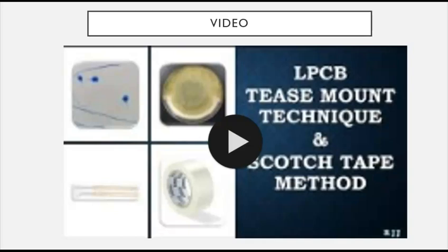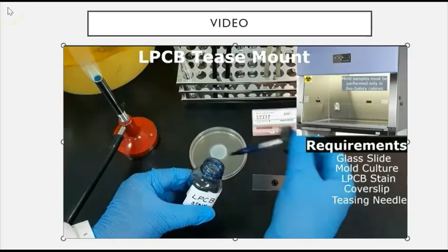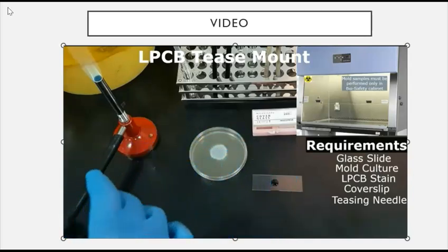Here's a quick little video of how to do the lactophenol blue tease mount technique and the Scotch tape method.